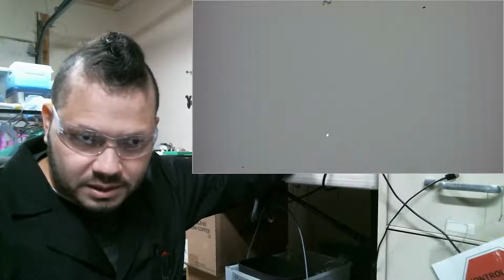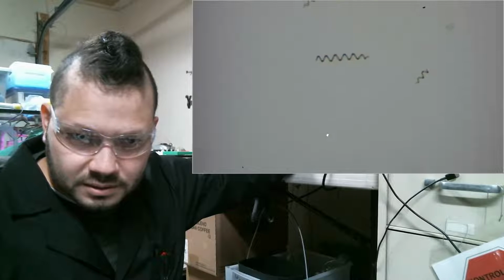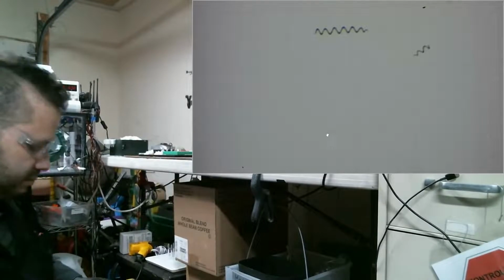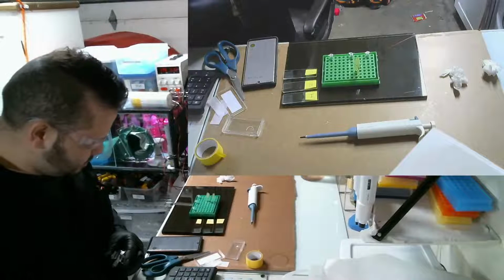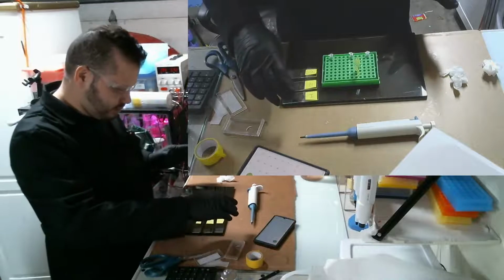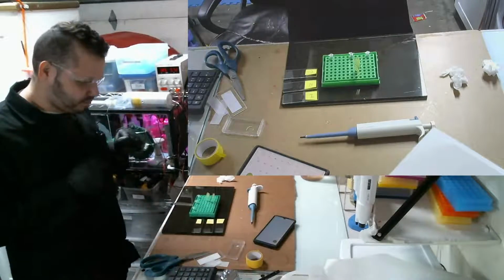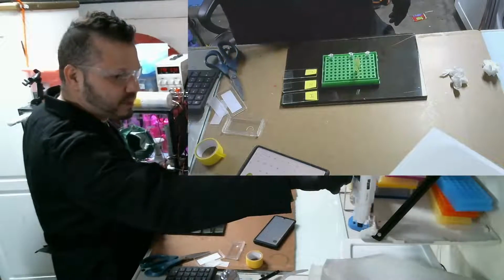I even see some new babies. Those are those little ones. And I got 31. That's interesting. Now let's do the math. Just over 19 million. It seems like the hormones aren't actually that great for the algae, but that's preliminary. It's only been 24 hours.